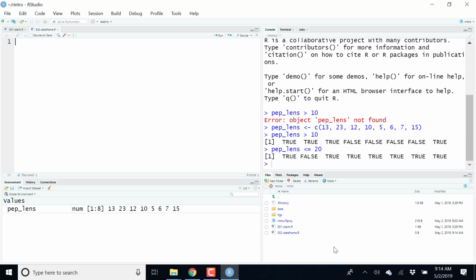And by the way, what I can do maybe over lunch or certainly at the end of the workshop is to save my R project. When I say saving the R project, it would be saving the directory that contains all these files and directories and sharing it with you. So all the code that I write, all these scripts that I write, you have access to it. So yeah, I can do that.